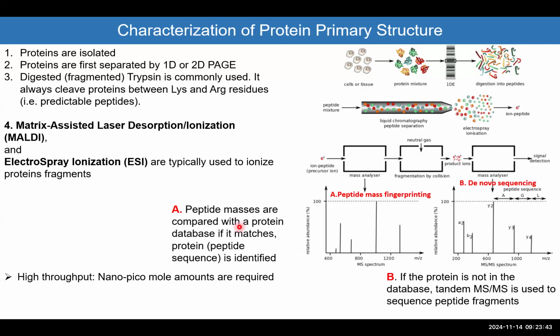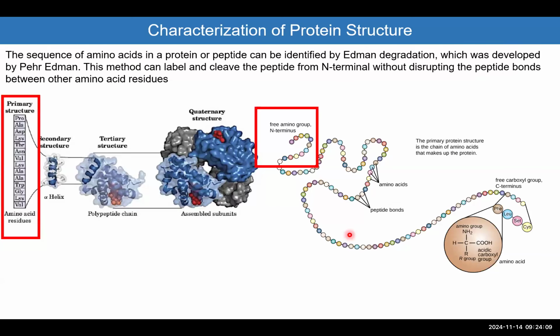Like now, for example, we have 600 different kinases. If you are looking for one of the kinases, we know the sequence, we know the amino acid sequence. So if a peptide like this one or that one or that one, based on how many amino acids and what is the charge that is showing up, we could easily, based on the sequence, say, oh, the amino acid, let's say here, phenylalanine, leucine, serine, and cysteine, it comes from this protein. So I can locate it back to which protein it comes from.